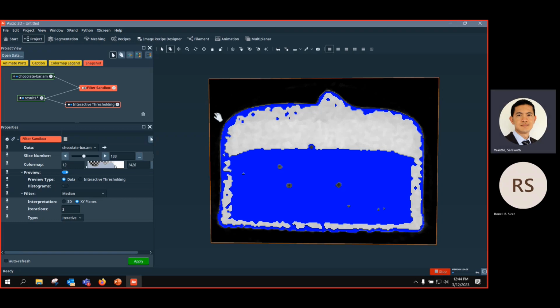Yes, we also have multi-thresholding that you can do for more phases. And later, tomorrow with the segmentation workroom, you can segment a lot of materials, 100 of them. And we have the tool called watershed segmentation based on the binary mask that we created. We will see tomorrow. But yeah, exactly, for watershed segmentation, you need at least 2 materials.